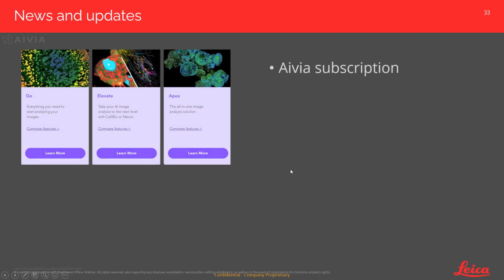Some final news and updates. Aivia is now available as a subscription, and we've made the switch to give you greater peace of mind. With a subscription, you not only invest relatively little at the beginning, but also you can always count on having full technical support as well as access to the latest software. You will never fall behind. You will always get support.